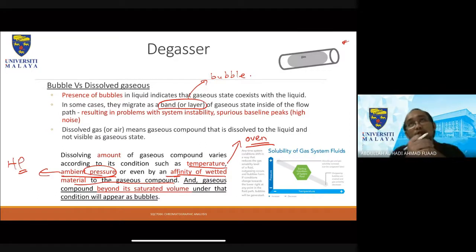For example, if I have an amphiphilic molecule, such as lipids, and you might have something like a cationic head, and the solvent that you use is aqueous, simply water, deionized water. What might happen is that the ionic head will dissolve in water, but the lipid does not.